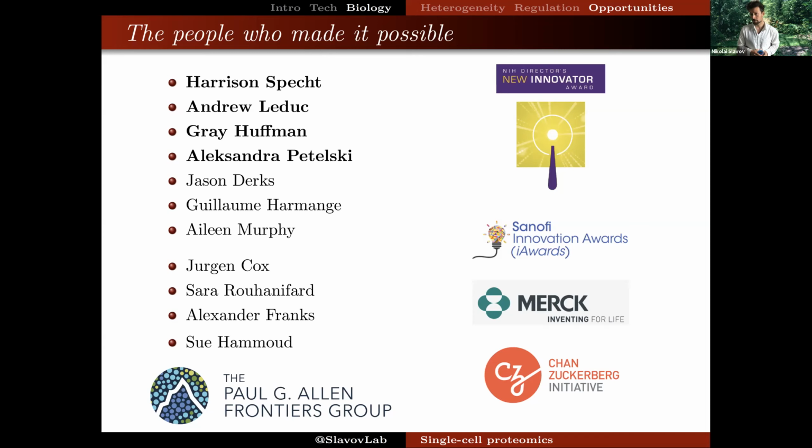I think it's just a matter of time until those are incorporated into widely used commercial instruments. At the moment, these are prototypes used in labs specializing in technology development. So the simple answer is, if your protein of interest is present at a level of a few thousand copies per cell, we have a good chance of quantifying it. The higher the abundance, the higher the probability of quantifying it. Of course, it becomes easy.